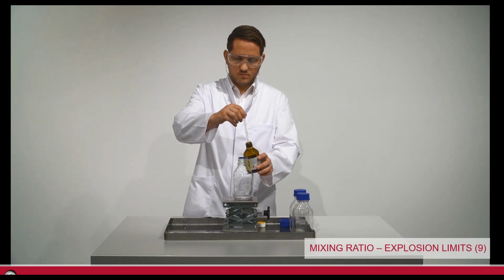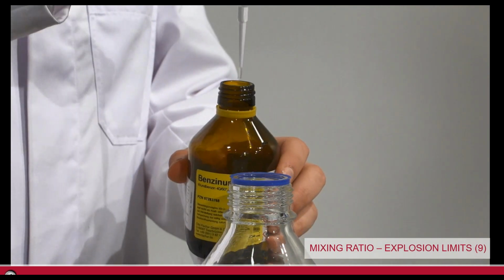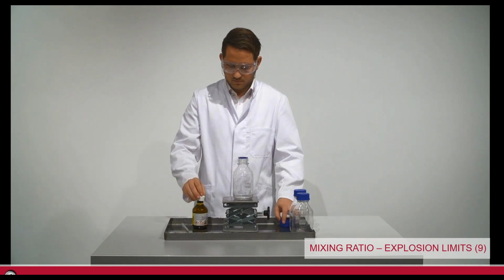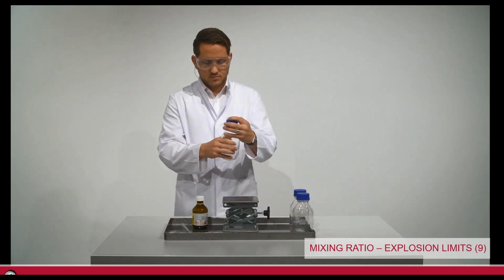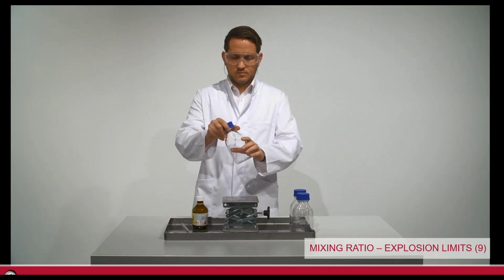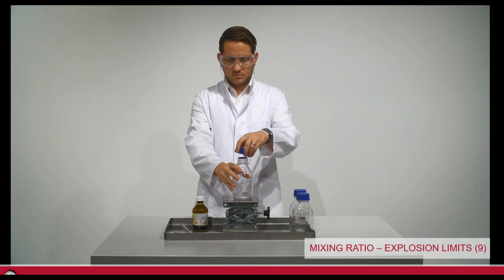So, 250 ml bottle, 1 drop. No worries, of course, right? He's going to shake that up and mix it into the air. You can't see it, anything like that. Everything's cool. He's going to induce an ignition source, and we'll see where that gets him.